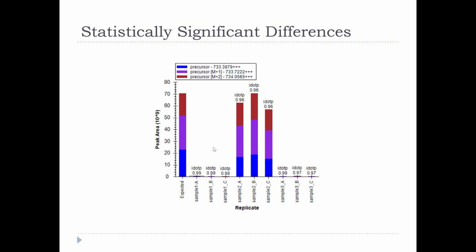And then does anybody see any information that makes you doubt? Like, I don't want to put this into MS Stats because 0.96 isn't quite as good as 0.97? Probably not. Okay. Yeah, who knows? So again, can't tell.